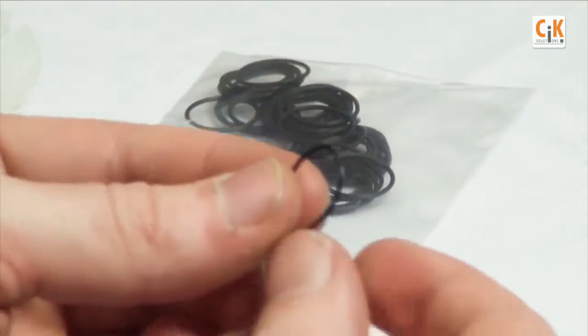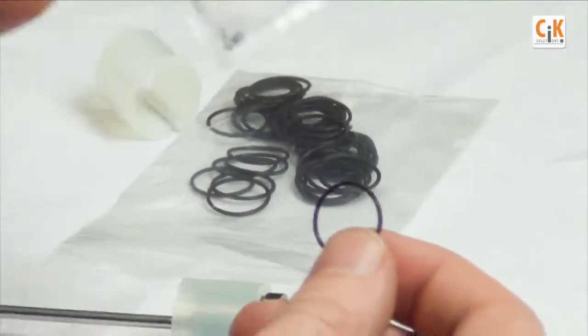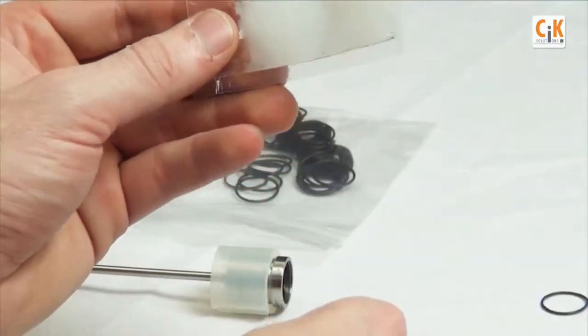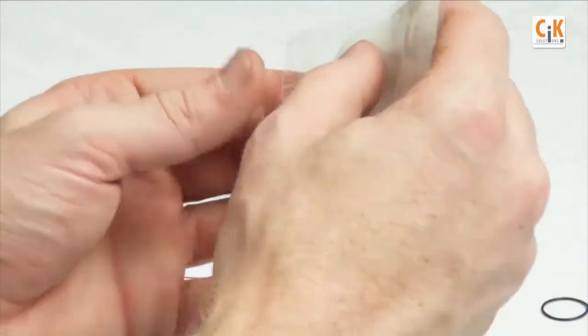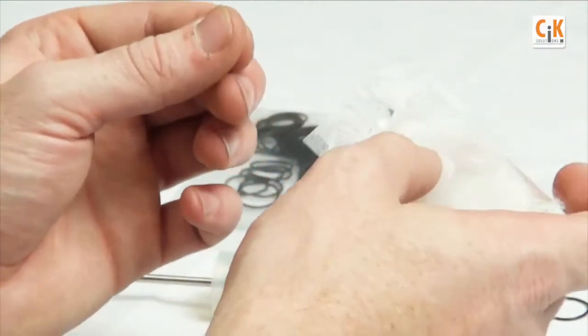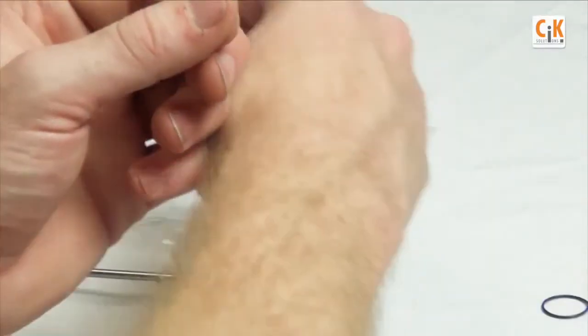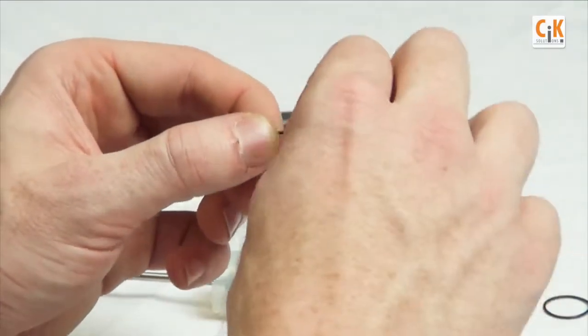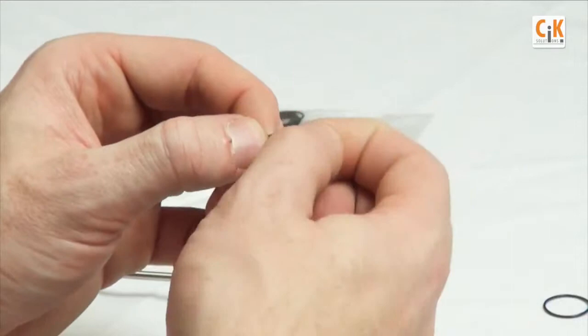Next, apply silicone grease to the new o-ring. Do this by rubbing a small amount on your index finger and thumb, and then slowly pulling the o-ring through your fingers to fully coat it.